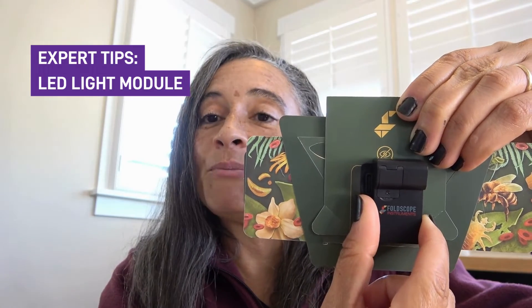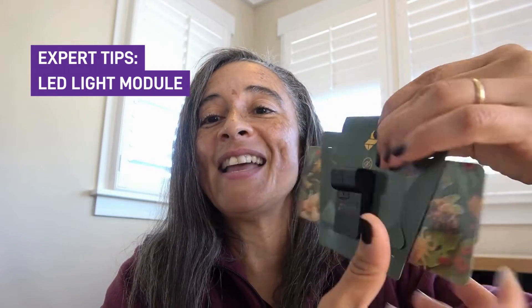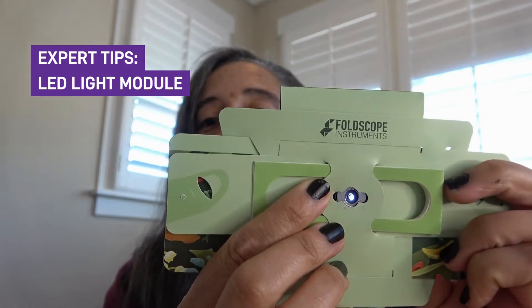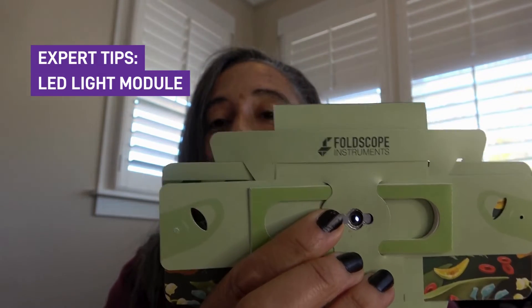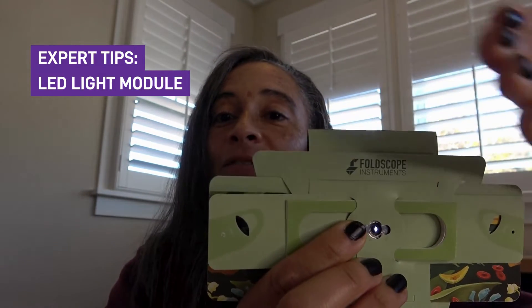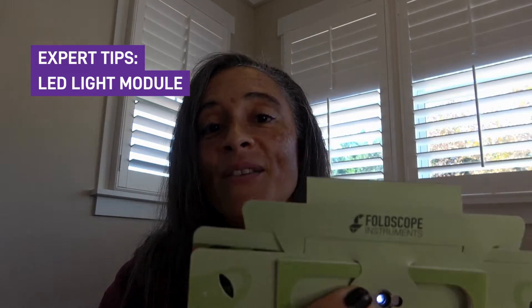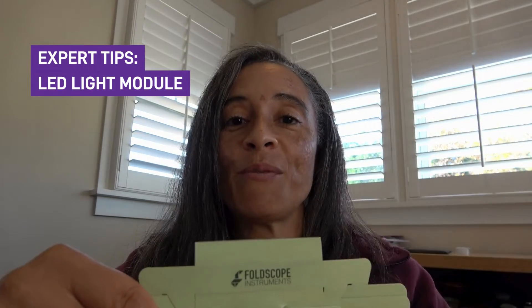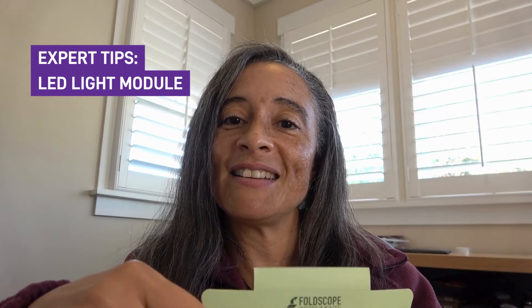Now you will have to hold it in place while you're looking at your sample because the magnet is going to want to pull it back. But if I just shift it to the side, you'll see that the light is now not coming at it straight — it's coming at it from an angle. Depending on what specimen you have, there are some specimens that will look like they're glowing compared to that dark background. Play around with the different lighting techniques and see what works best for the specimen that you have.